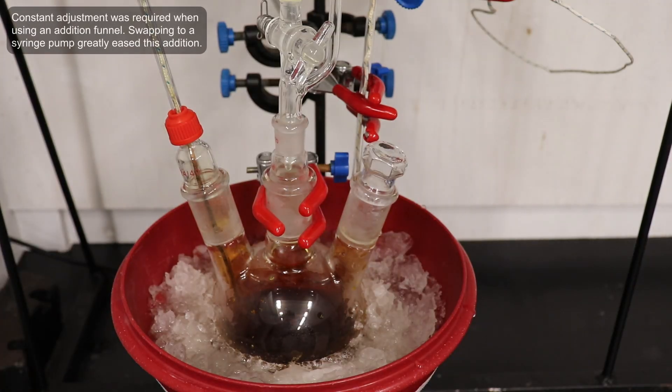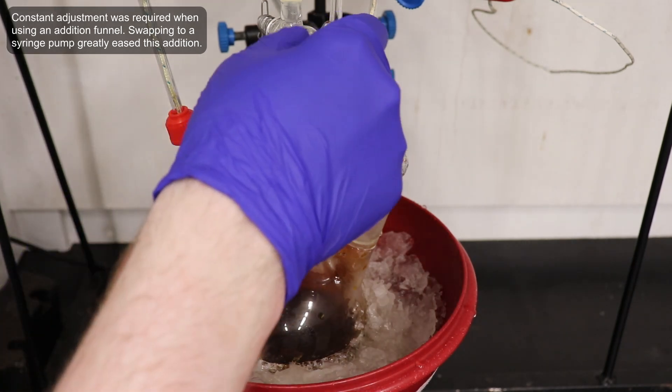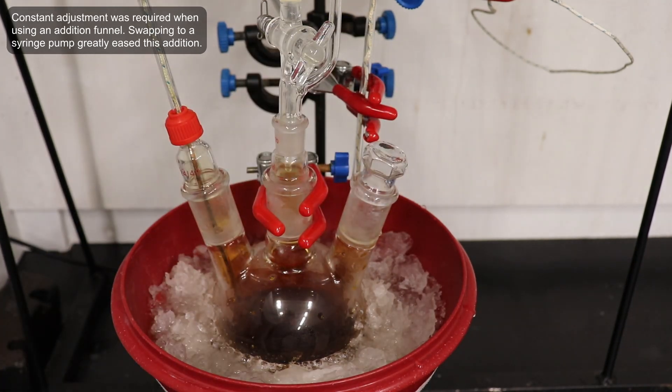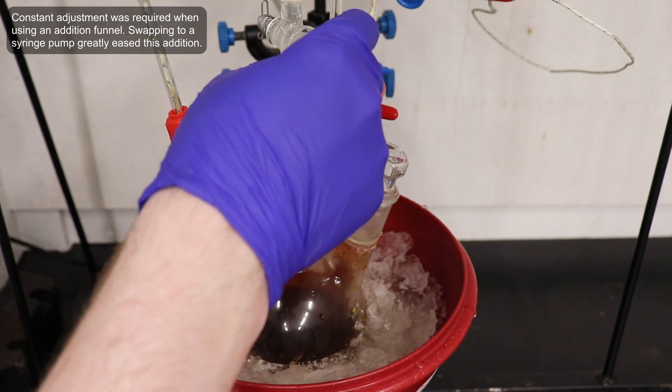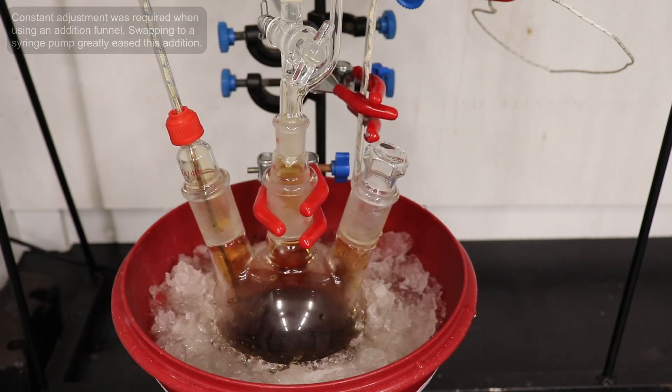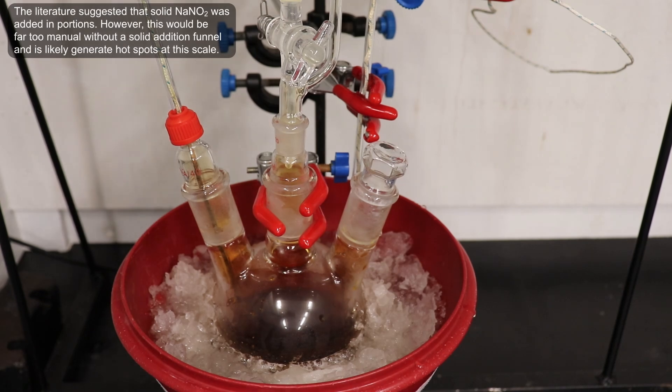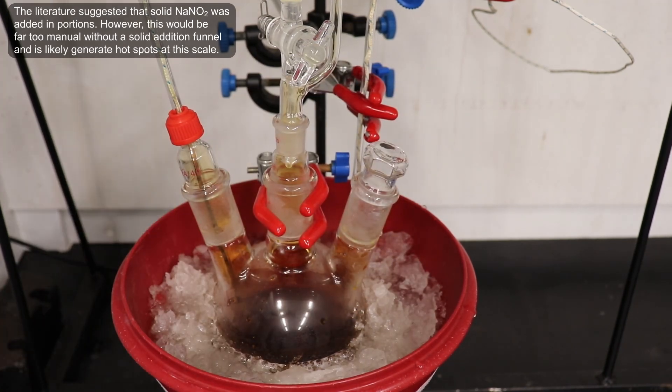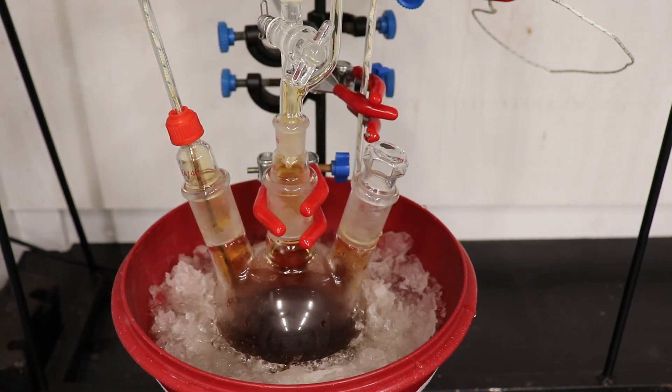I have previously attempted this reaction using various pressure-equalized addition funnels, however, the high surface tension of the nitrite solution prevents the establishment of a constant, slow drip rate, and every few minutes the dripping would stop, requiring readjustment of the stopcock. Although, it still is entirely possible to use an addition funnel for this reaction.